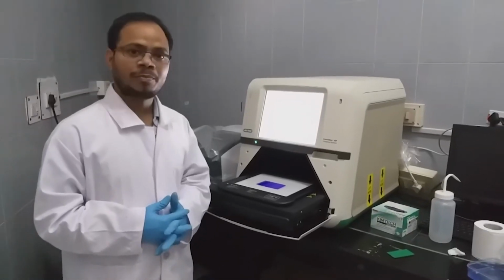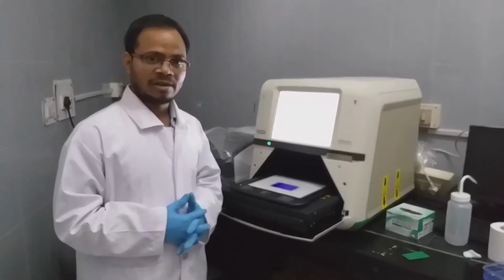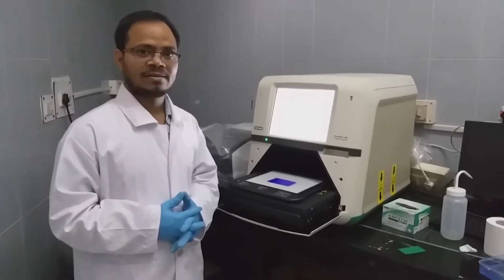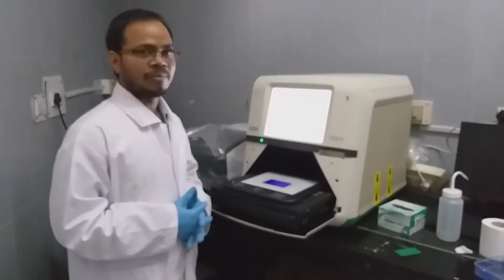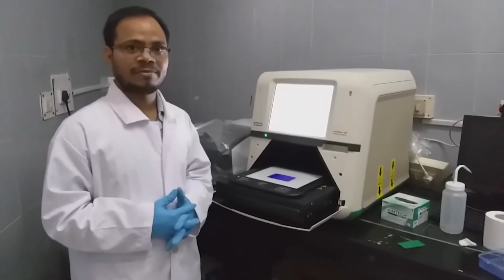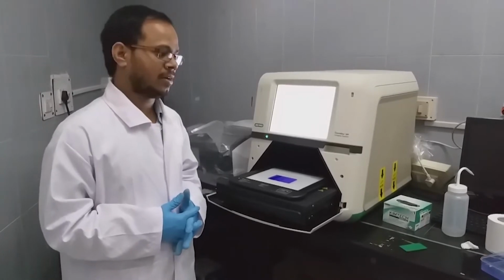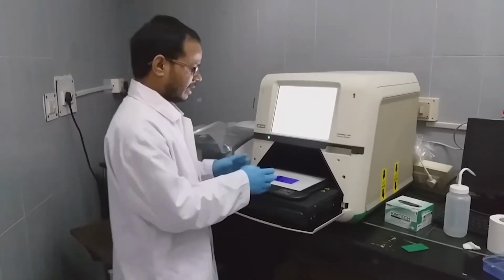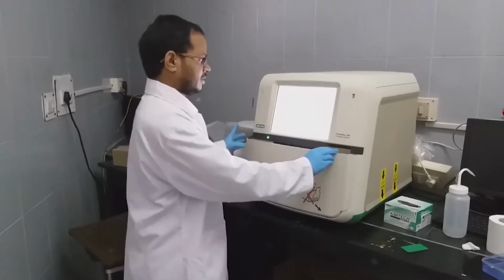So we purified the protein using the nickel NTA column. We ran the gel and stained and destained it. So now it's time to document the gel. We have to identify whether we got any single band fraction or not. So this is the gel I kept on a white tray. Now just close it.